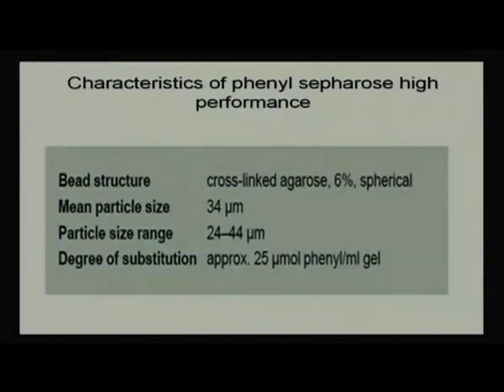When we select the matrix for suitable protein separation, meaning which type of hydrophobic molecules are better separated, the resolution is improved.